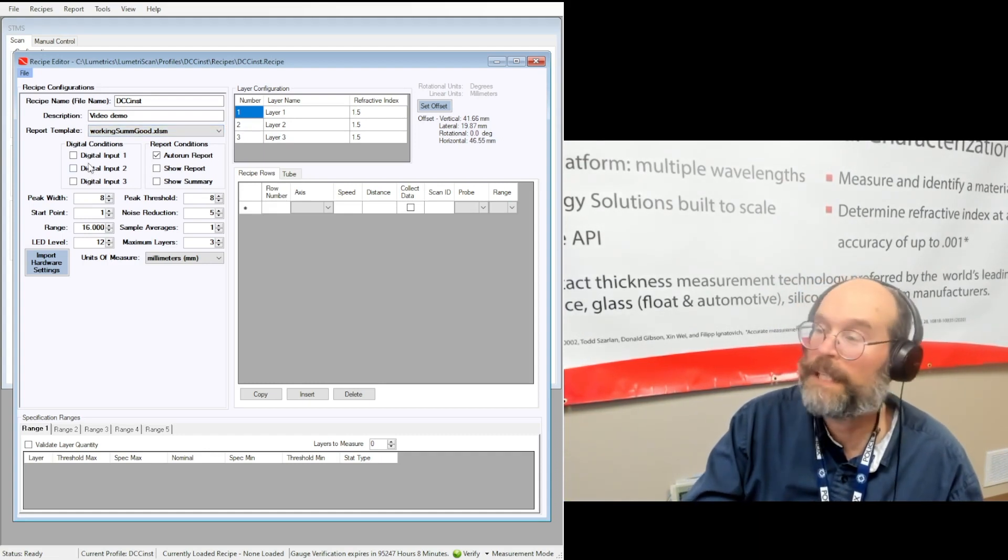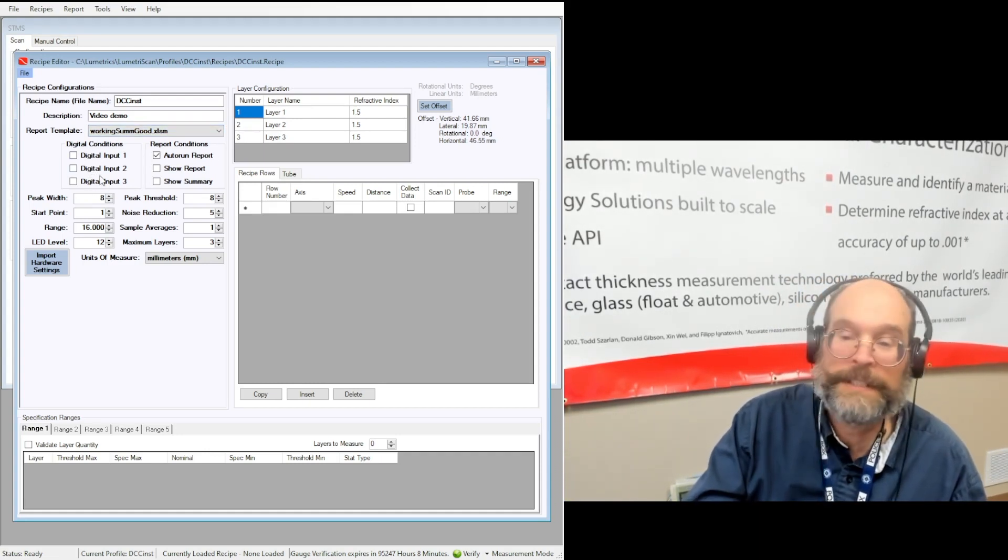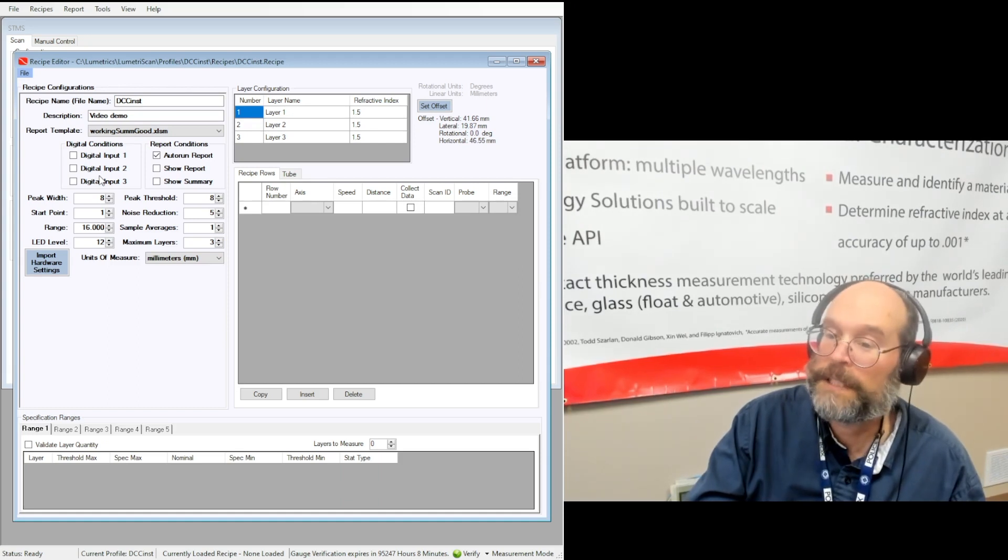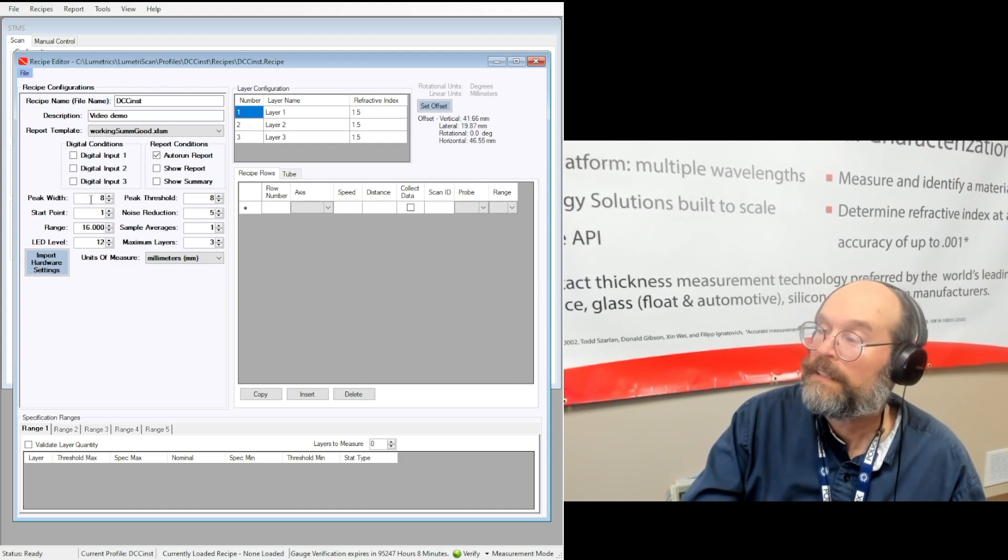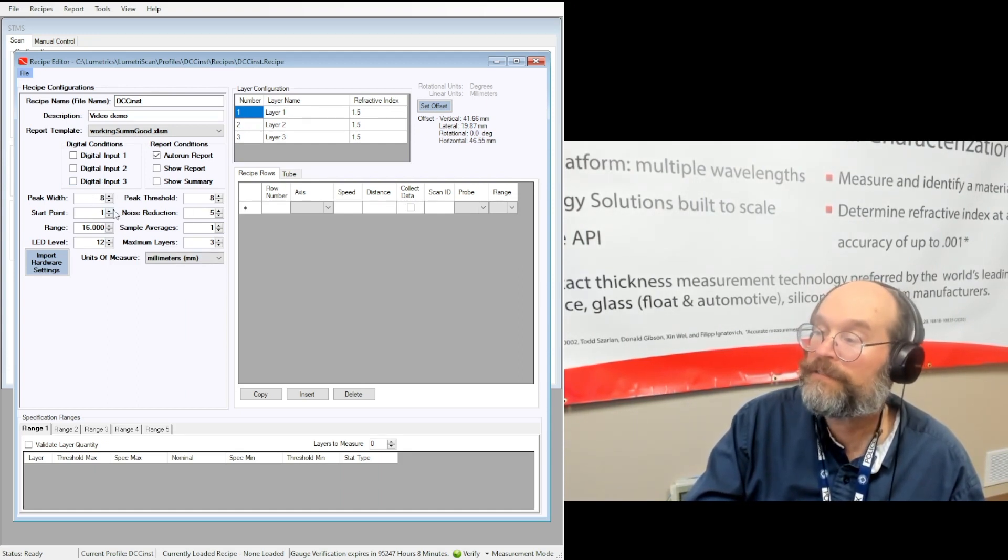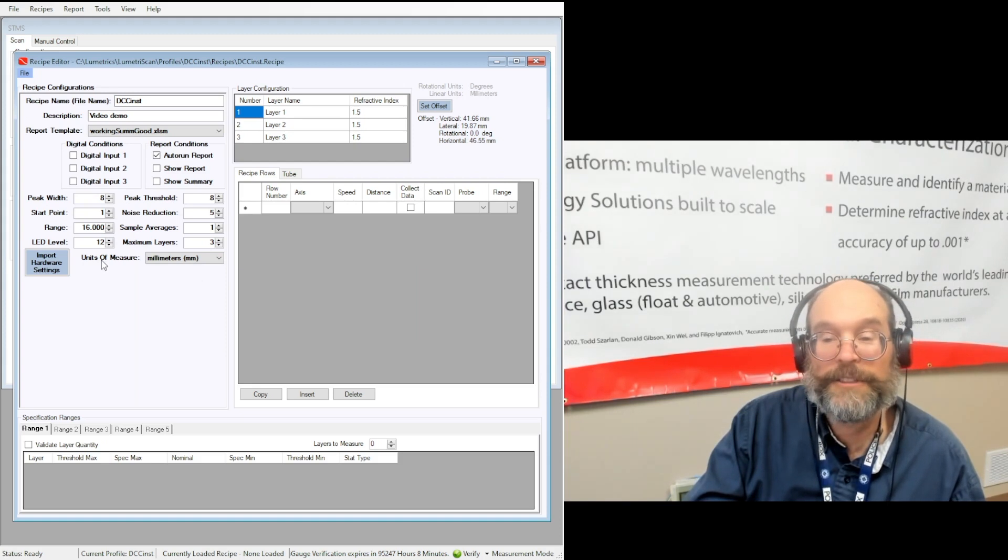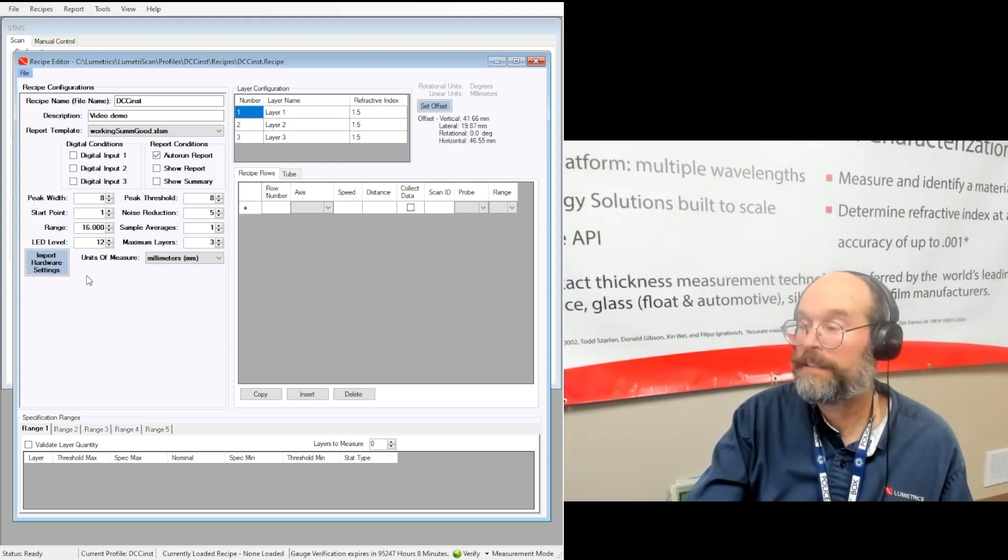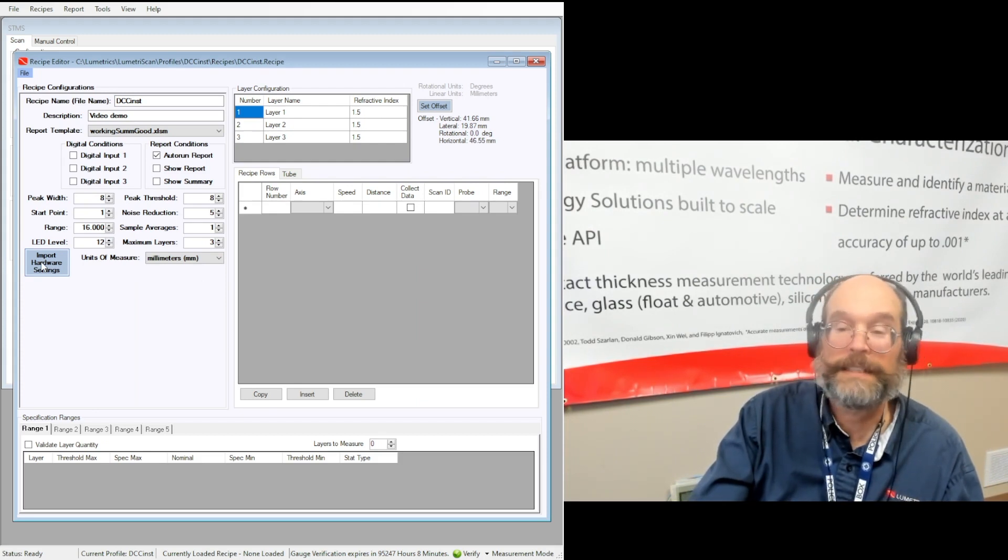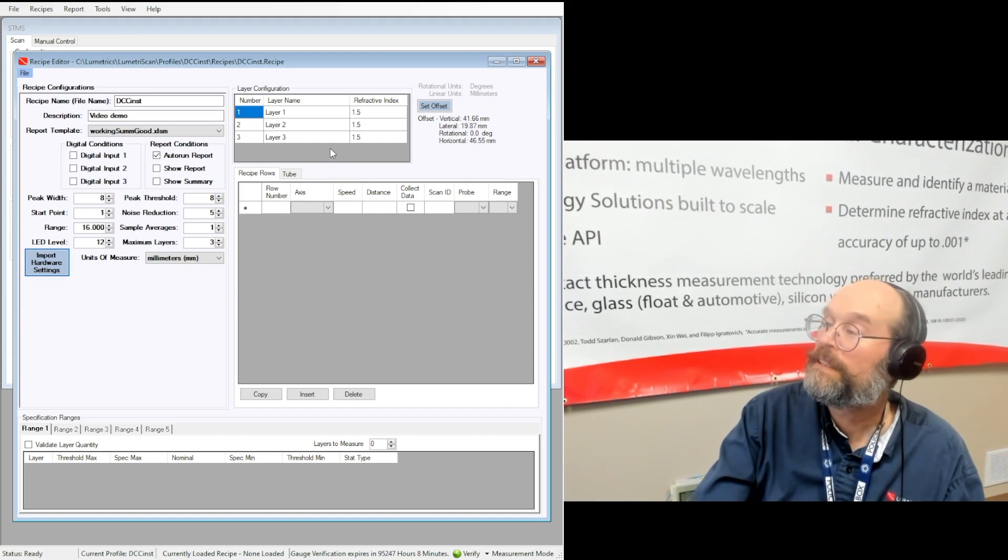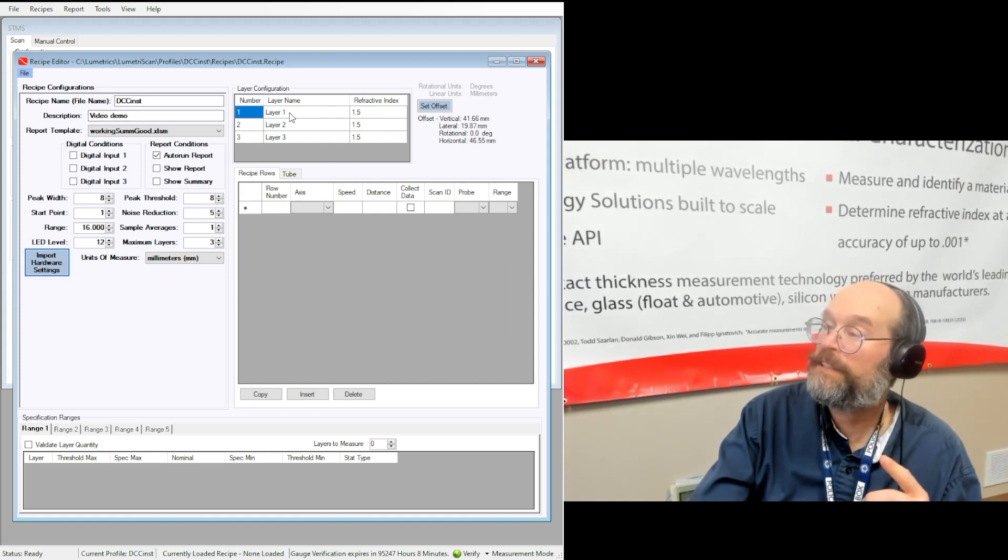If you have the STMS, most likely you won't be using the digital inputs. If you have the Lumetra scan, you probably will be. Okay. So this section here, it's the OCC stuff. And if you set everything up with the OCC, great. The only thing you should do then is import the hardware settings by clicking on that button and you're ready to go. Okay. Let's move over to layer configuration.